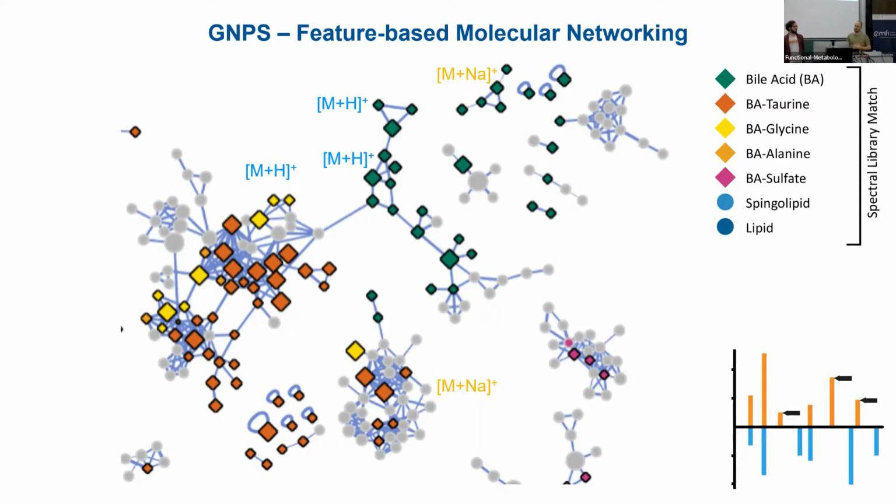And it basically brings together these kinds of artifacts that we see here. So this is the perfect example. You have sodium clusters for some molecules located elsewhere in the network, because due to different energy levels of these different adducts, they fragment differently than protonated adducts, and hence they're disconnected. That I think is one of the bottlenecks of just MS2 based networking, and we hope that IIN improves that a little bit.